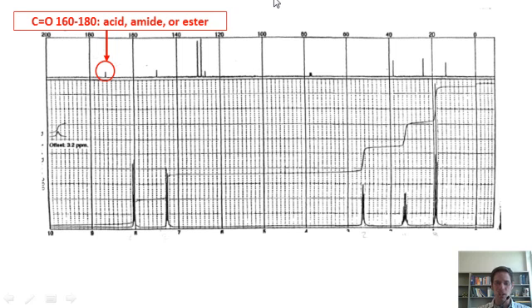I'm going to do my integrals. The smallest integral I'm going to measure with my little ruler and decide, yeah, that looks like about 1 in height. I'm going to call however many millimeters that is 1. And proportionally, I'll measure from horizontal to horizontal each of the remaining integrals. Horizontal to horizontal is about twice that height, so this is 2. This one is also about the same, so it's 2. I also measure the remaining, and I find 2 to 2 to 3.